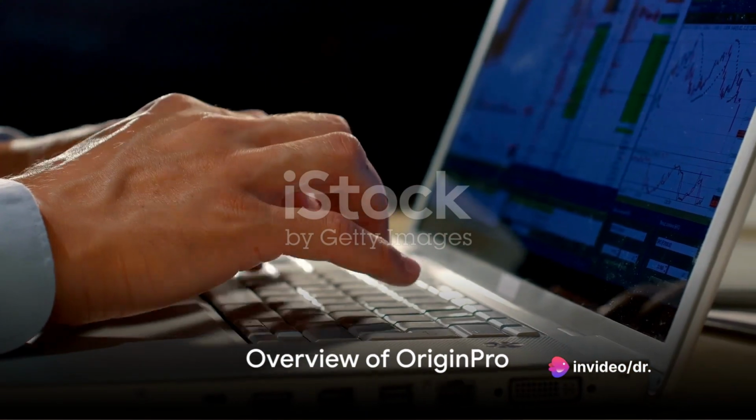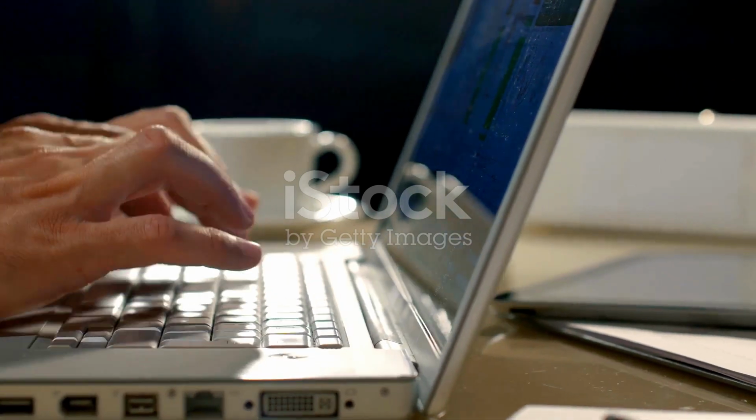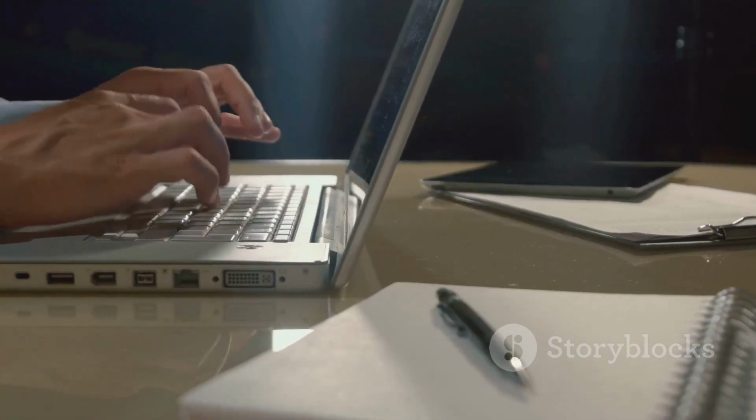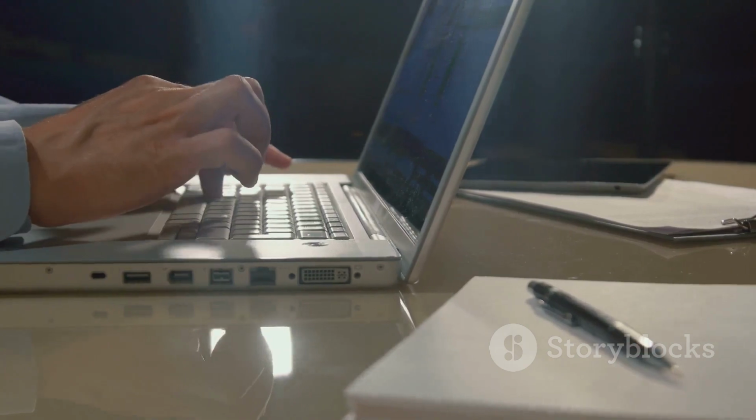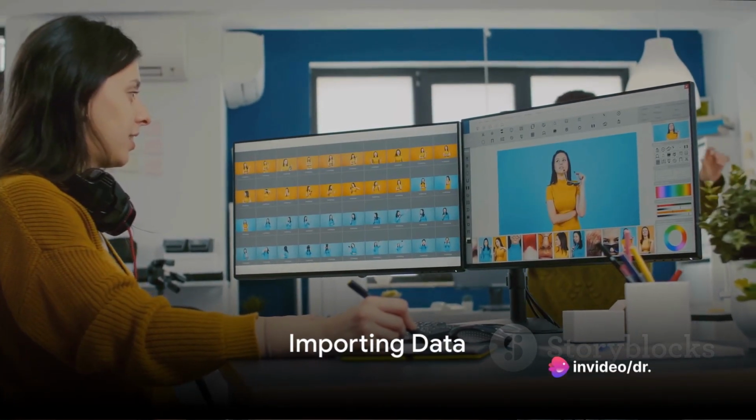First, start by opening Origin Pro on your device. Origin Pro is a leading software developed by Origin Lab that provides a data analysis and graphing workspace for scientists and engineers. To create a graph, the first step is to input your data.